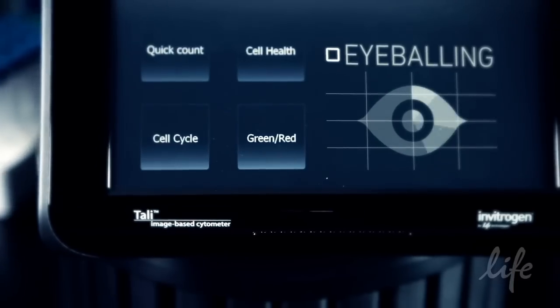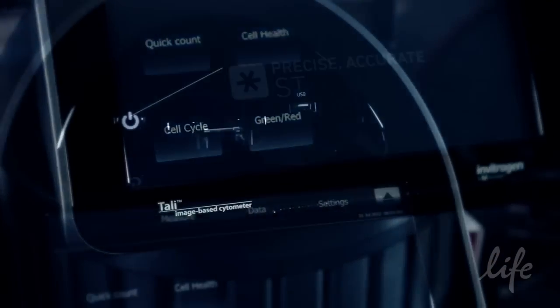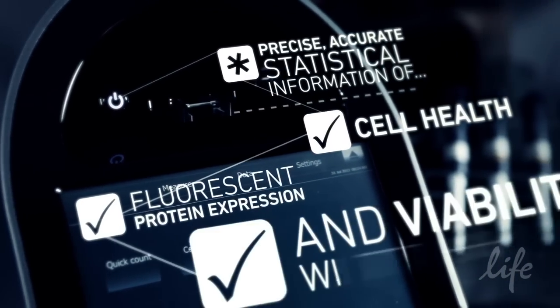Where researchers once relied on eyeballing, the TALI image-based cytometer now gives precise, accurate statistical information of cell health, fluorescent protein expression and viability.